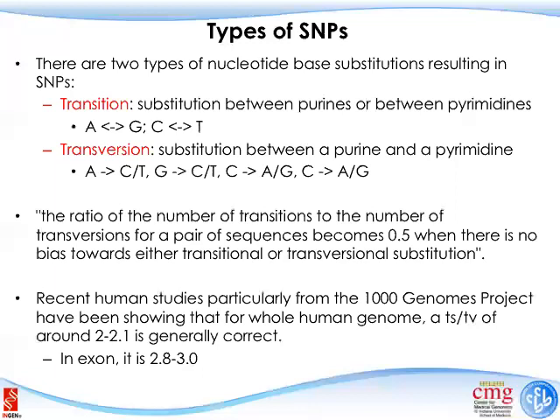It's something that we look at for every one of our whole exome sequencing or whole genome sequencing data. So we will calculate this transition transversion ratio after we complete the experiment. If you tell me that after your experiment you found the transition transversion ratio is 0.5, I would say there are a lot of things that went wrong. I don't know what went wrong, but there are a lot of things wrong.